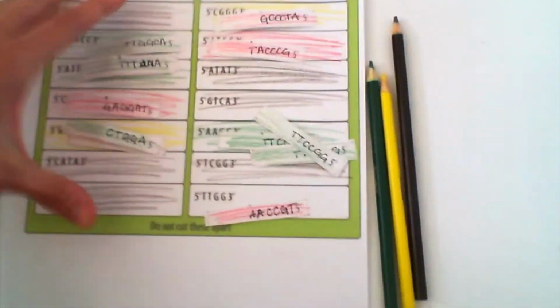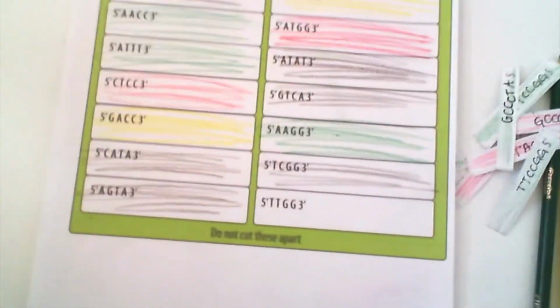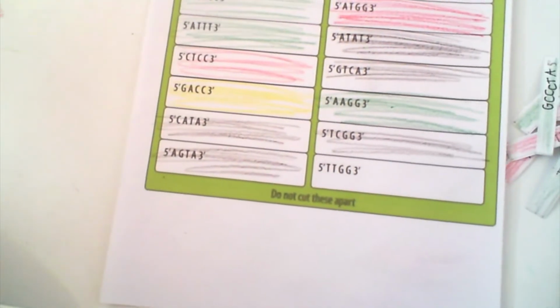So looking at this, if I were to remove all of this so it's a little more clear, there are exactly 1, 2, and 3 genes that we want to look at in regards to this plant that was given no sun, to see exactly how that plant is behaving due to no sun, because obviously those genes are overly expressed. If this was cancer, we would want to look at these genes in regard to cancer to see why it's overly expressed in that individual and see what we can do to fix it, look at personalized medicines to see if we can fix these overly expressed genes.